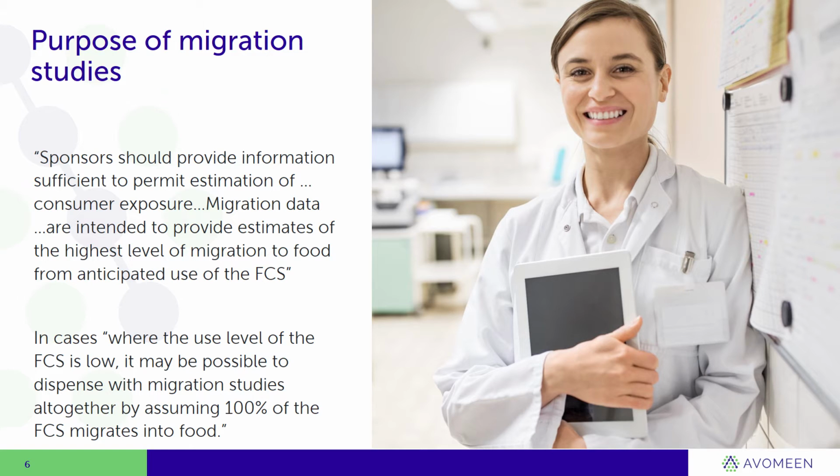In cases where the use level of the food contact substance is low, it may be possible to dispense with migration studies, like an additive that you use at a fraction of a percent. You assume that 100% of it migrates into food, and if it's still safe, then you're good to go. But in a lot of cases, you can't assume that, or the numbers are too much, and you have to go on and do a migration study.